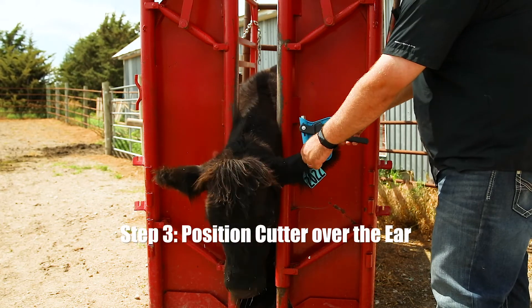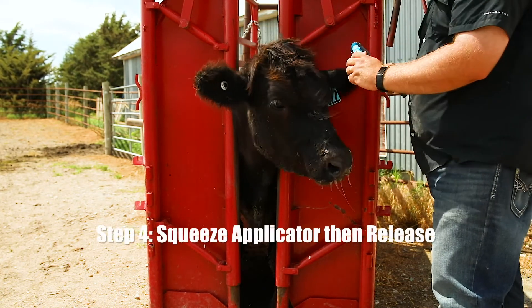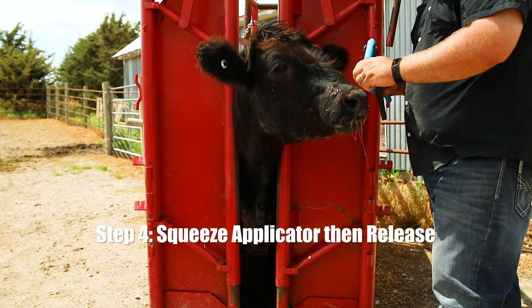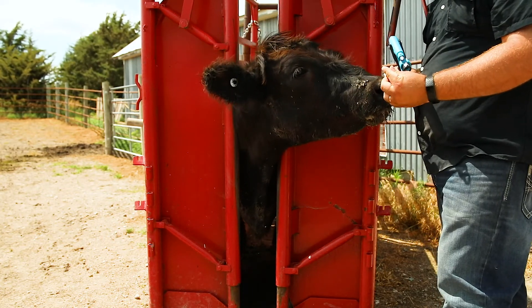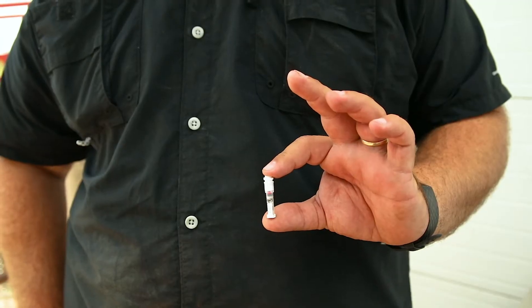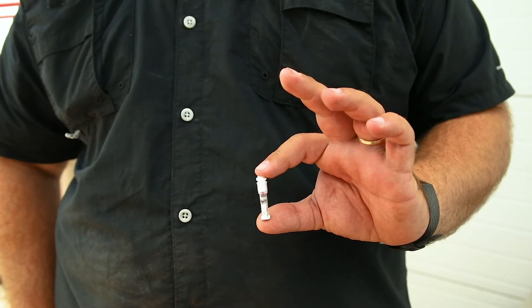Position the cutter over the ear, squeeze in a gentle, continuous pressure, and release. This action deposits a small tissue biopsy into the vial. Each vial contains a preservative and is uniquely numbered and barcoded.